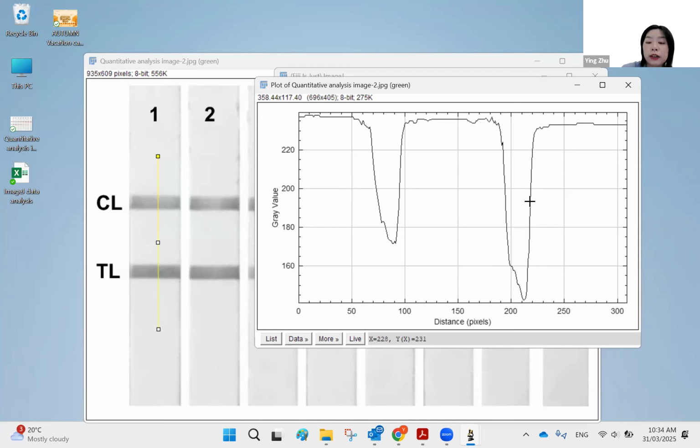So that means you first need to get, if I move this cursor, you can see here they're actually showing some numbers. Okay, if I move around, it gives the X and Y. Okay, if I move it to, say, the dip of this peak, then it gives me some number. And here, I just want to know the Y number. Okay, so if I place the cursor here, then it's showing the Y is 143.